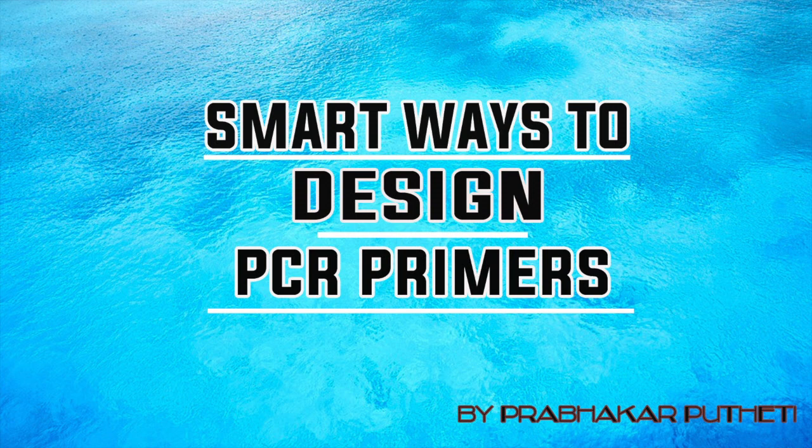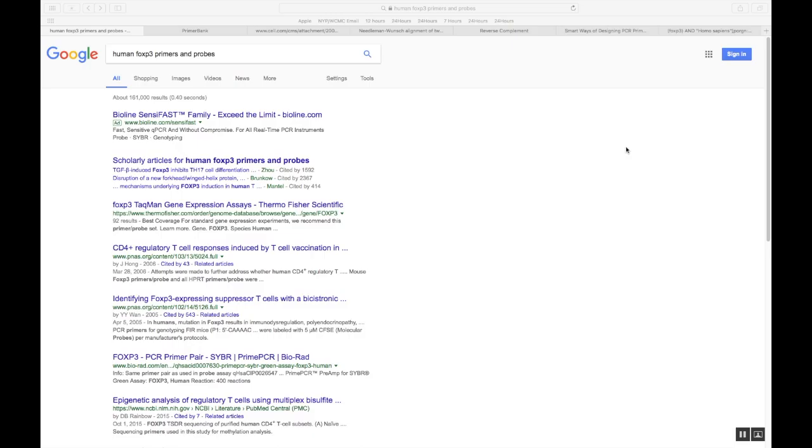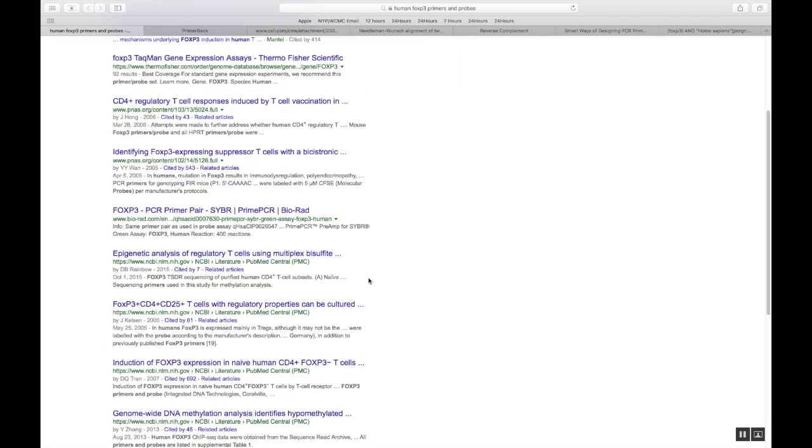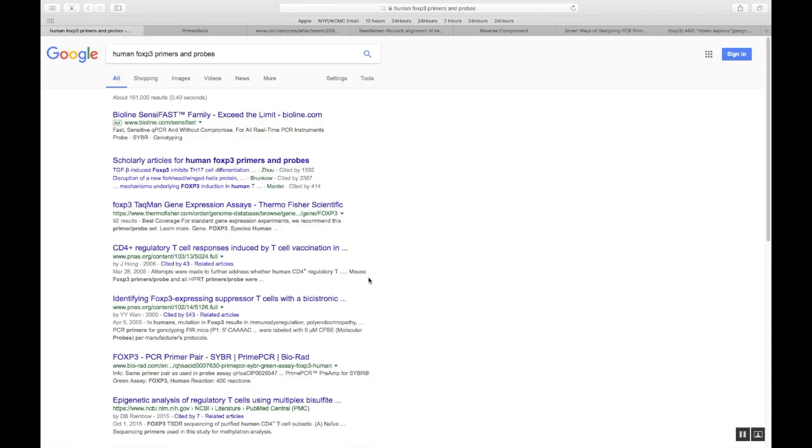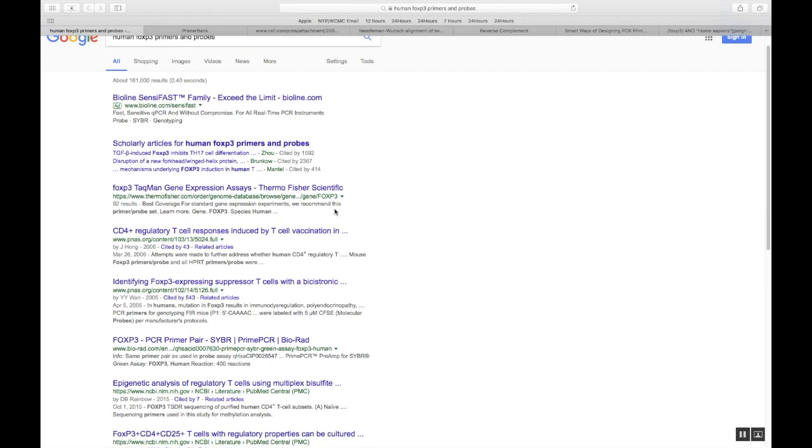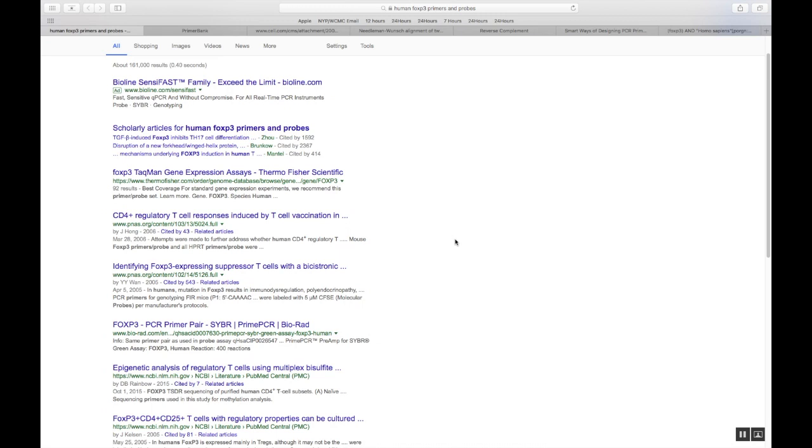One way to do it is just go to google.com and google it. So here I am in Google, and I'm giving the Human FOXP3 primers and probes as my search because that's what I want to design. Once I gave a search, I got a lot of articles and advertisements and product advertisements like Thermo Fisher and all. I don't want to go there. I just want to find a good, decent article, and I find it here. It's a PNAS article. So I click that.